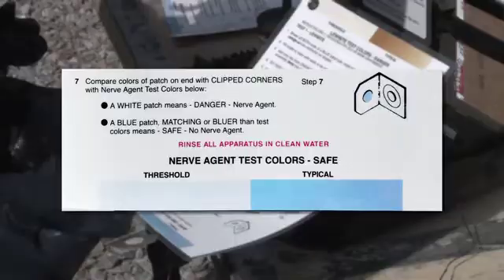You will compare the colors of the patch on the end with the clipped corners with the nerve agent test colors on the instruction card. A white patch means danger, nerve agent present. A blue patch matching or bluer than the test colors means safe, no nerve agent present. Any color changes after your initial reading should be disregarded.